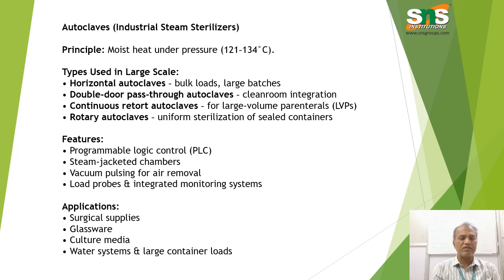What are the features? We know what PLC is, programmable logic control. Nowadays almost all sterilizers used in industry have integrated PLC and SCADA programming. Next, steam jacketed chambers, and vacuum pulsing for air removal for safety purposes. Next, loading probes and integrated monitoring systems with high-level sensing equipment. What are the applications? Surgical supplies, glassware, culture media, water systems and large container loads. The things we discussed under applications almost all undergo sterilization in autoclaves.